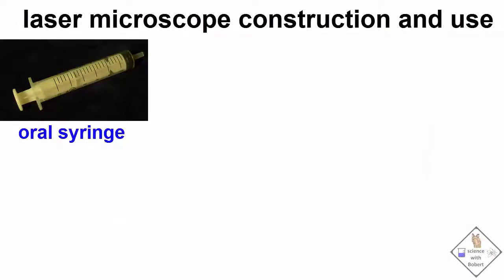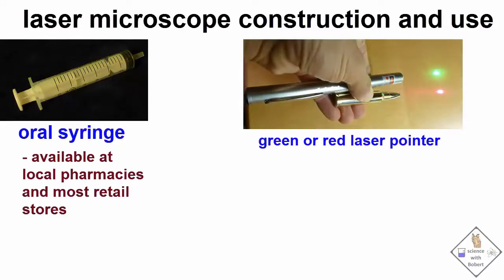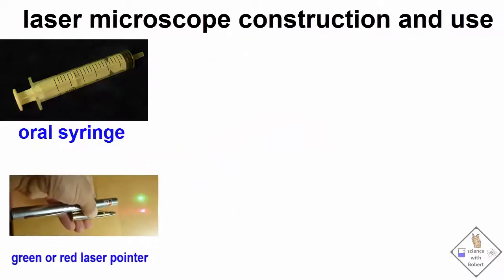When building your laser microscope, it is best to use an oral syringe like that in the picture, so there are no sharp parts. Oral syringes are inexpensive and available at the corner pharmacy and most retail stores. Both green and red laser pointers will work. Just make sure they contain fresh batteries.